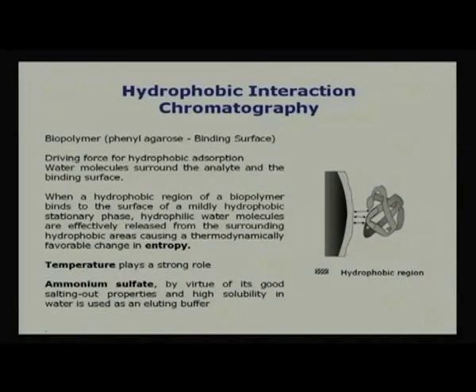Phenyl agarose is one of the matrix molecules which can be used for hydrophobic interaction chromatography. The driving force for hydrophobic adsorption is within the molecules themselves. Water molecules surround the analyte and the binding surface.